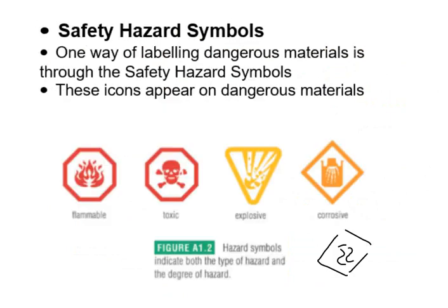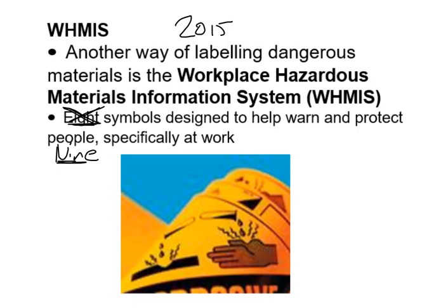Okay. Safety thing number 1, you need to know the symbol of the shape. Red octagon, very dangerous. Orange diamond, kind of dangerous. Yellow triangle, be careful. Okay. Usually these are found on household products, like bleach or hairspray. Anybody have hairspray? Look for this symbol on there. You'll probably see an explosive symbol on it, but probably not toxic, because that'd be bad, right? Corrosive would be on, say, a bottle of bleach. Okay. That's one thing you should know.